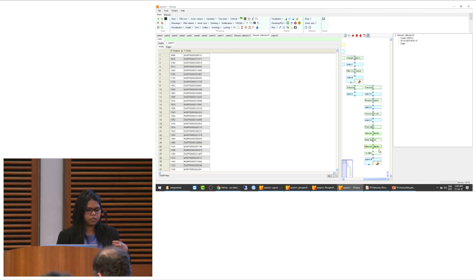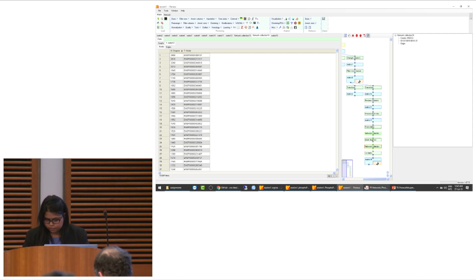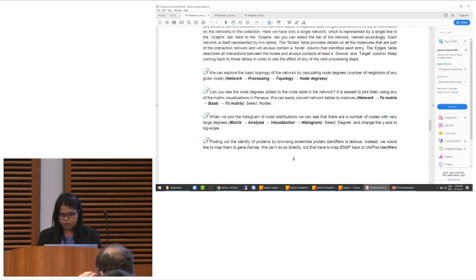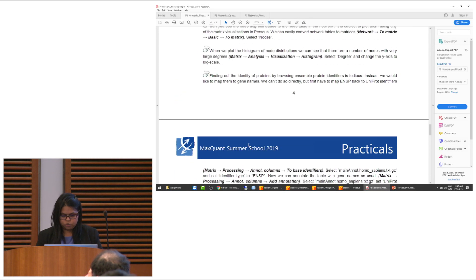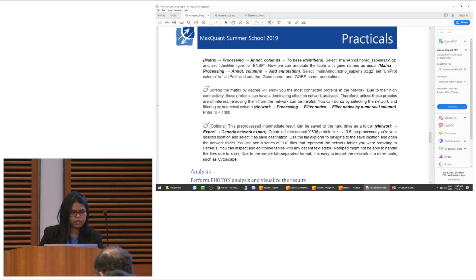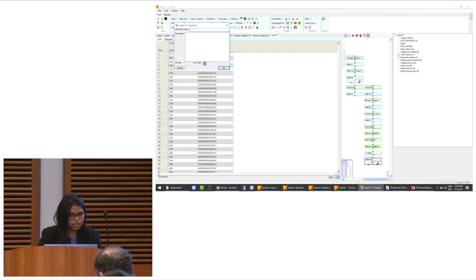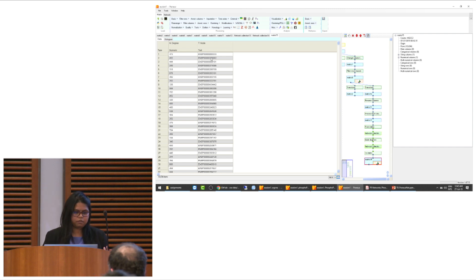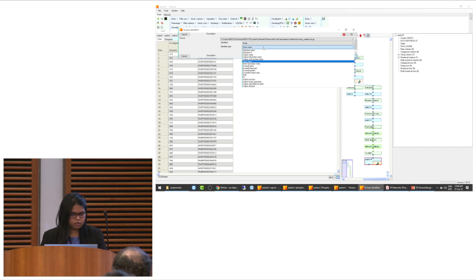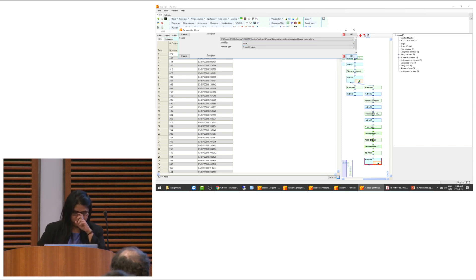According to the tutorial, first visualize the node degree distribution in a histogram. Convert the network back to a matrix by going to the Matrix tab, selecting 'To Matrix', and choosing the nodes table. Now this is a Perseus matrix, so you can perform all visualization steps including plotting the histogram of the degrees to see the full distribution.